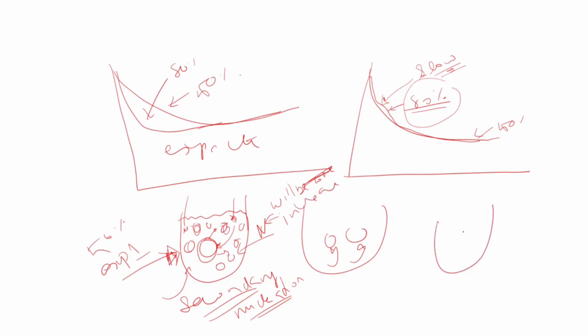So what we are thinking is we have only one particle, but due to secondary nucleation, we might have more than one particle. In that case, the mass moving from solution to solid may be almost similar to your experiment 2.